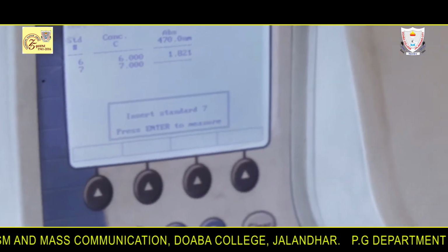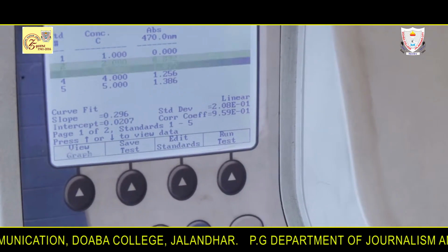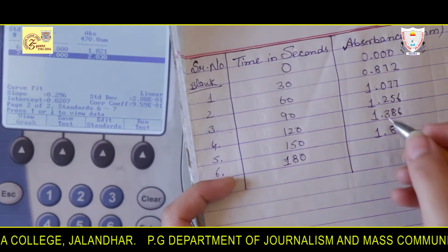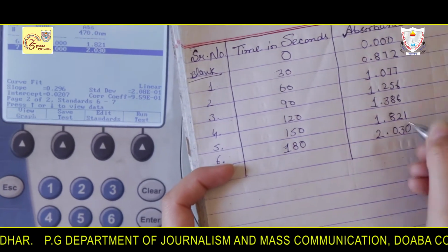The reaction kinetics under 3 different conditions will be compared on the basis of their readings and analyzed to see the effect of concentration of enzymes, which are shown by the graph.